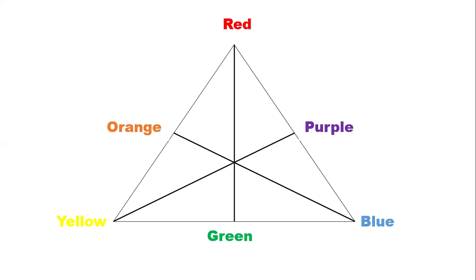In biochemistry, there are a lot of measurements taking place, including measuring the light absorbed by a substance in solution in the visible or ultraviolet region of the electromagnetic spectrum. Usually, we use photometry or spectrophotometry to do that measurement.